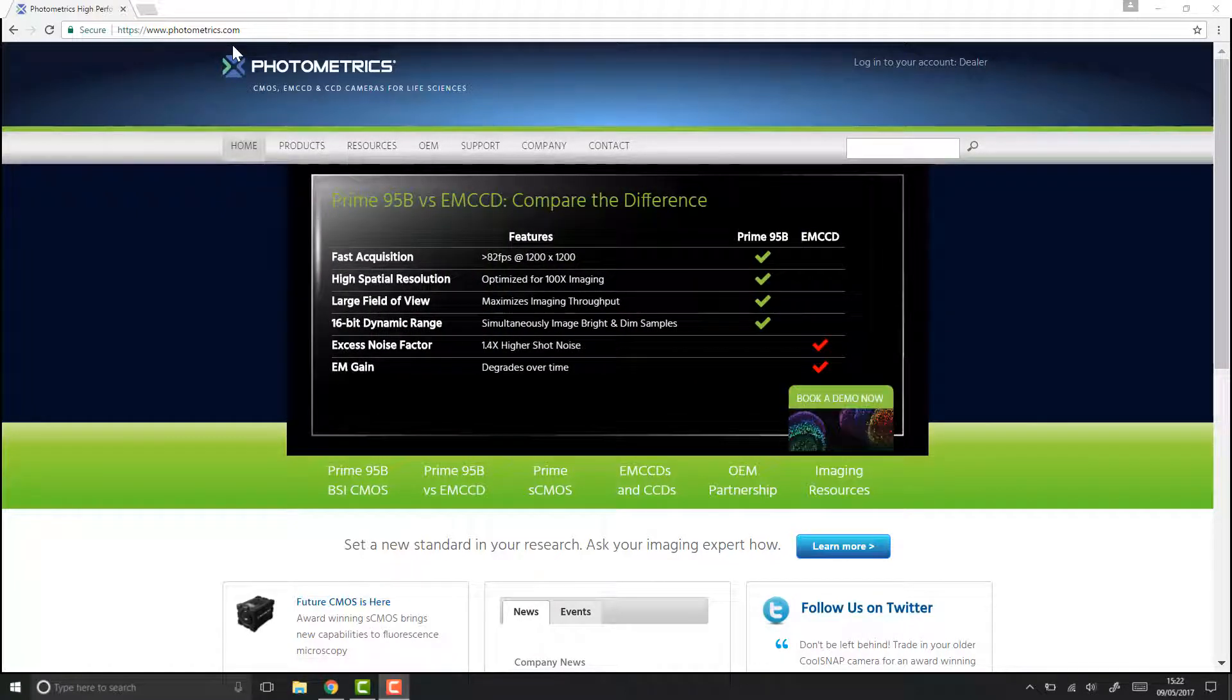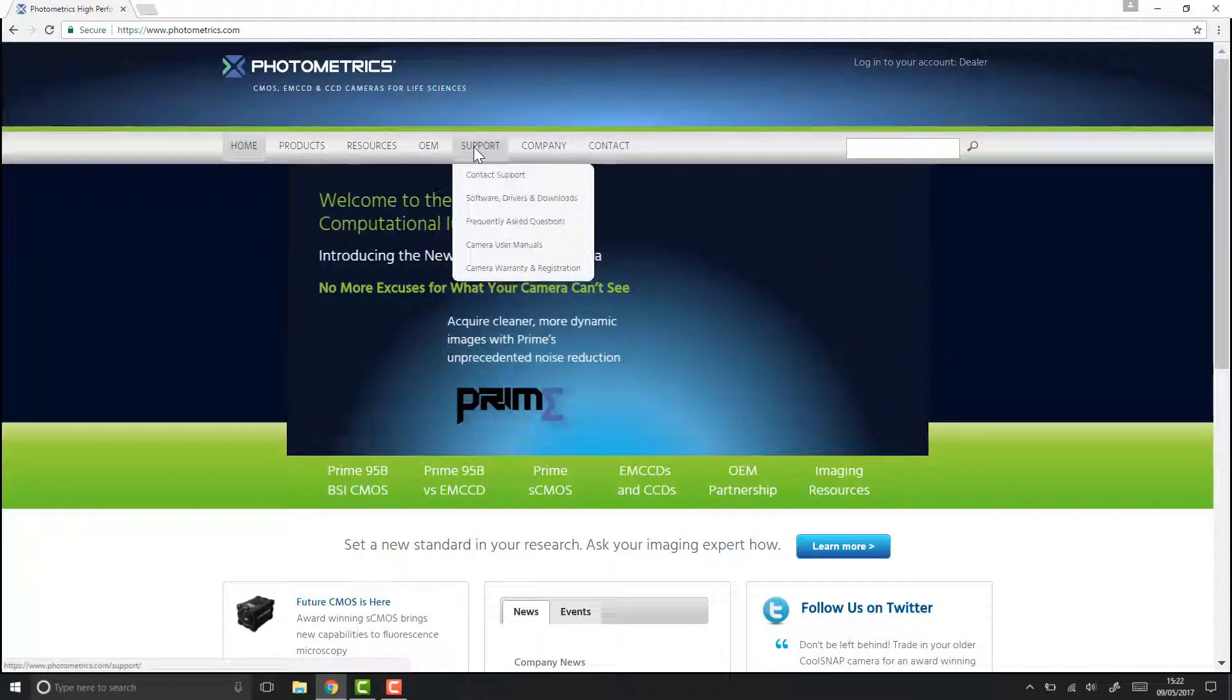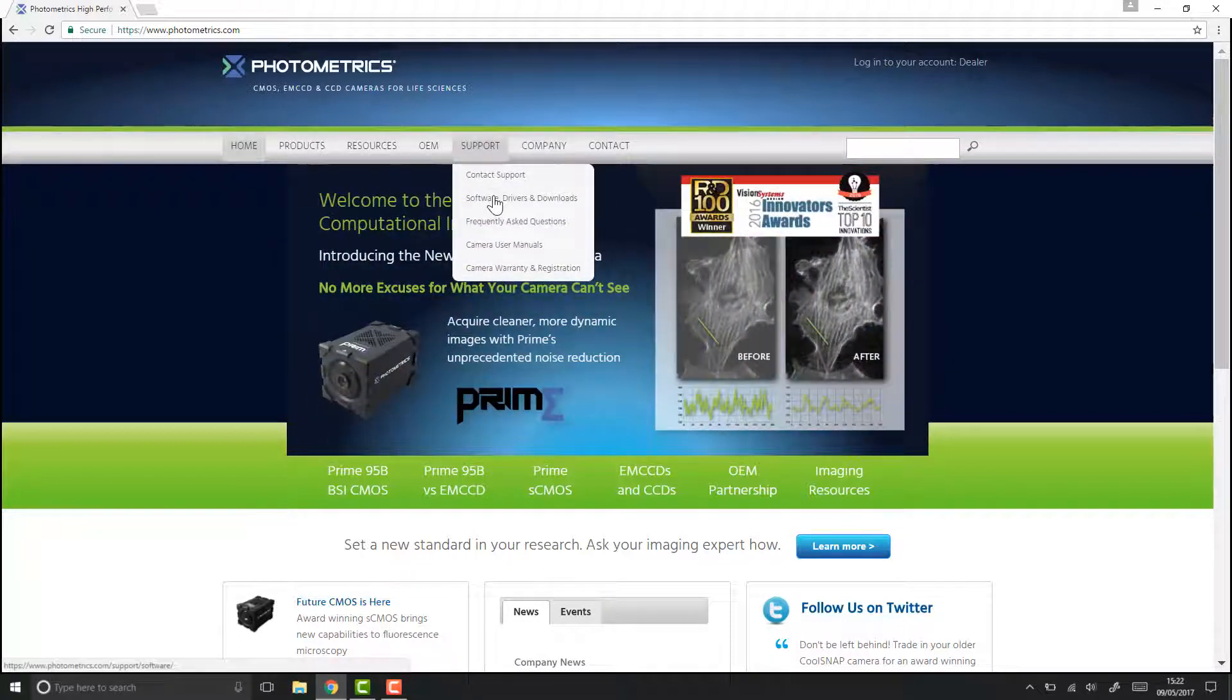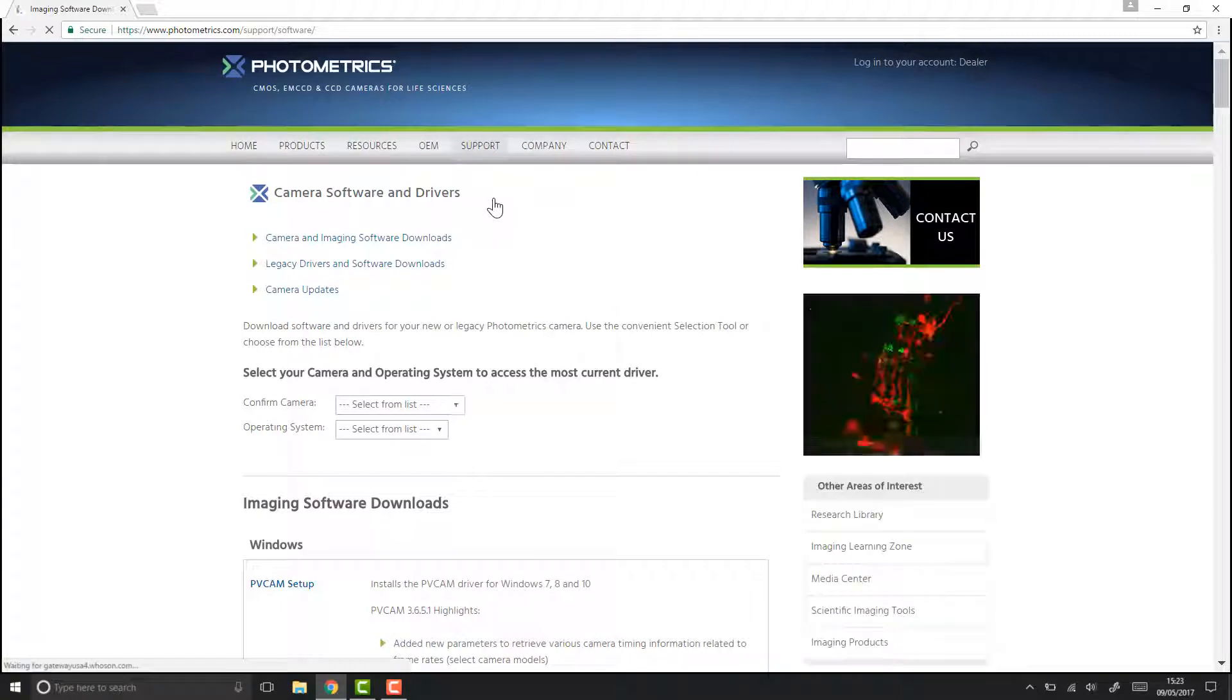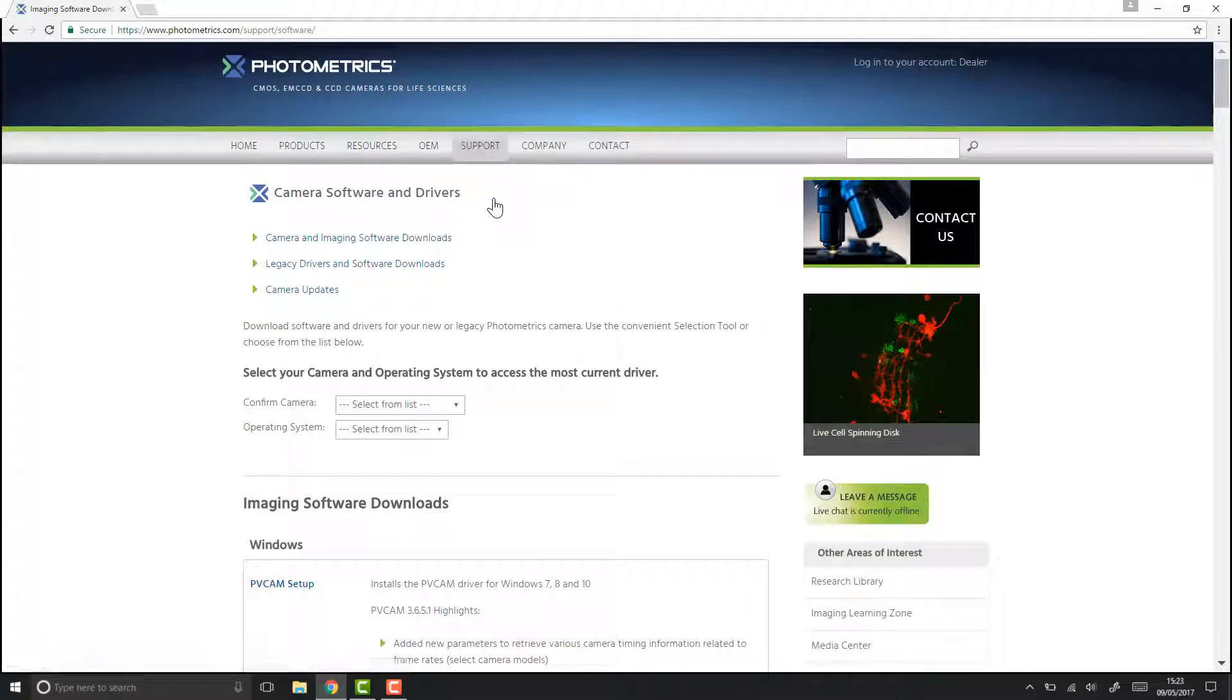Here we are on the Photometrics website and we want to go to support, software drivers and downloads. This will take us straight to the page to download PV Cam.